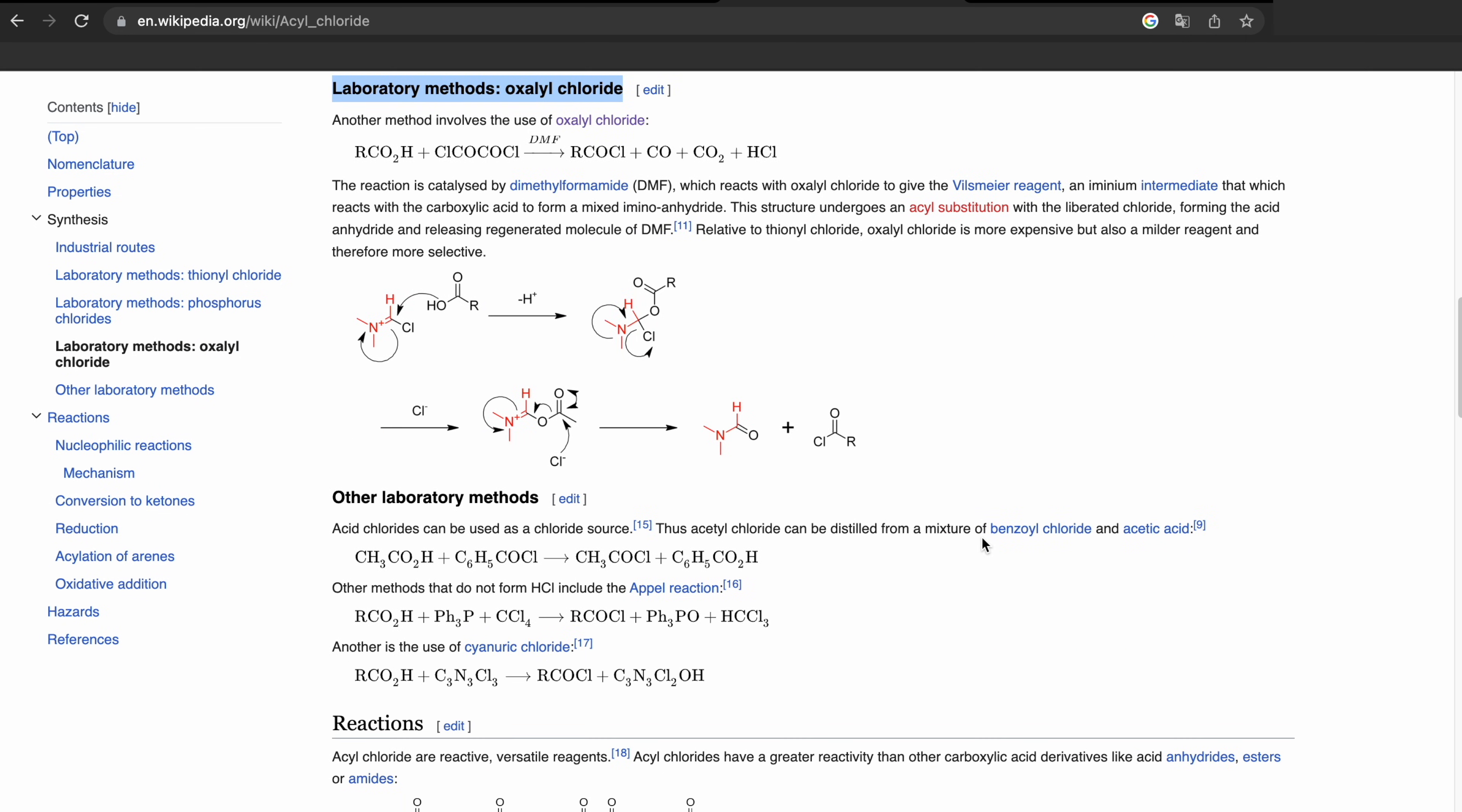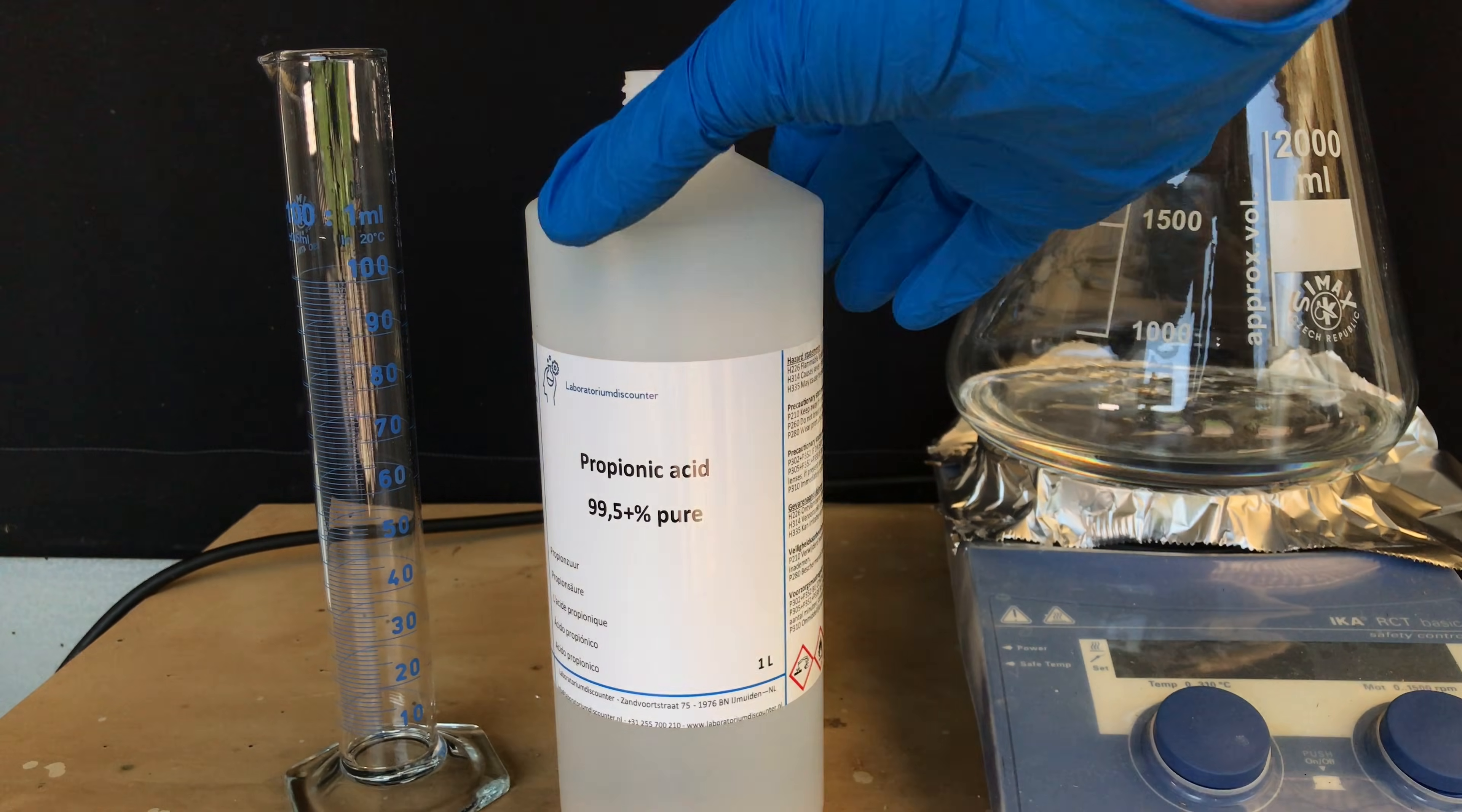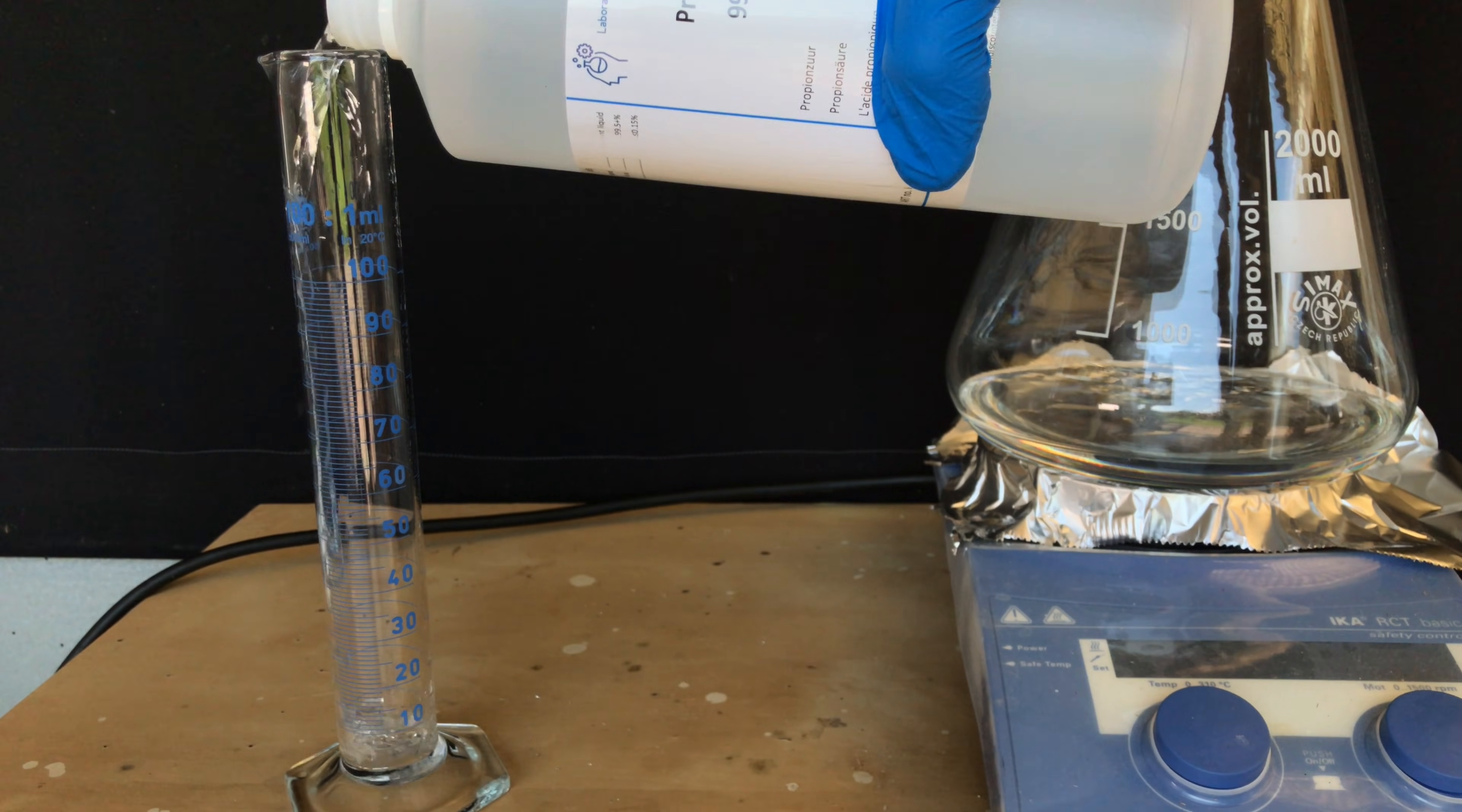These routes can be used for most carboxylic acids. Benzoyl chloride cannot be used for most carboxylic acids. When using benzoyl chloride it is important that the resulting carboxylic acid chloride is a somewhat slow boiling liquid.